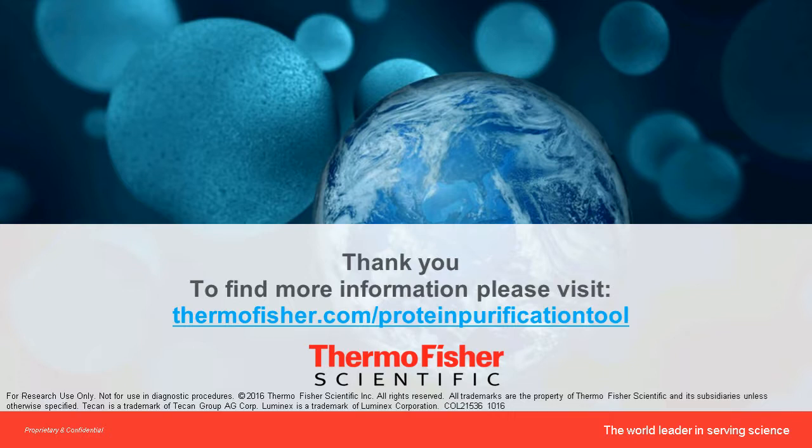So we do see the differences, but we validate them and make sure that we have the maximum amount of antibody that we are using in a multiplex format. And the highest we have done multiplexing so far is the 12 targets for the AKT-mTOR pathway. So that comes out to about 15 microgram of antibody in a single assay.